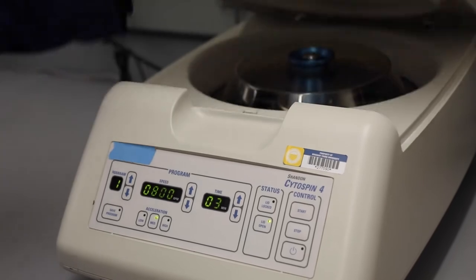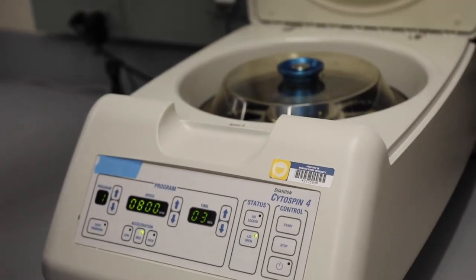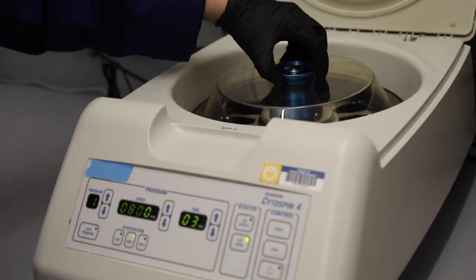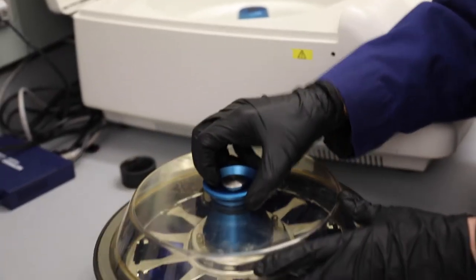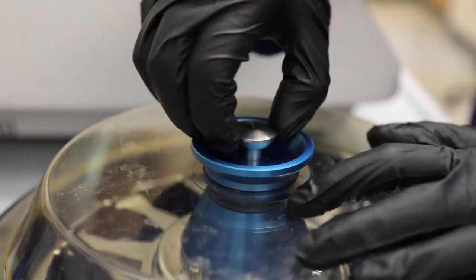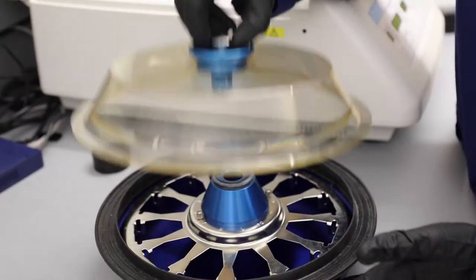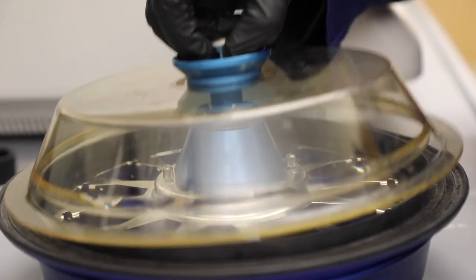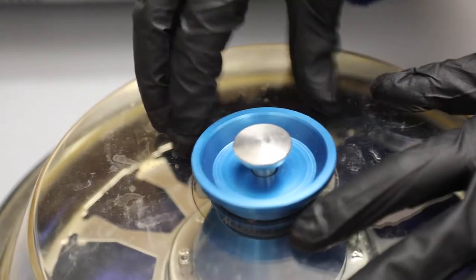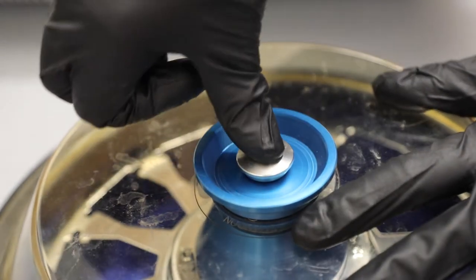The rotor is vacuum sealed and must be removed from the Cytospin before opening in order to avoid damaging its spindle. To open the rotor, pull up on the rod in the center to release the seal, then remove the top. To reset the seal, make sure the plastic top is firmly in the base and push down the center rod.